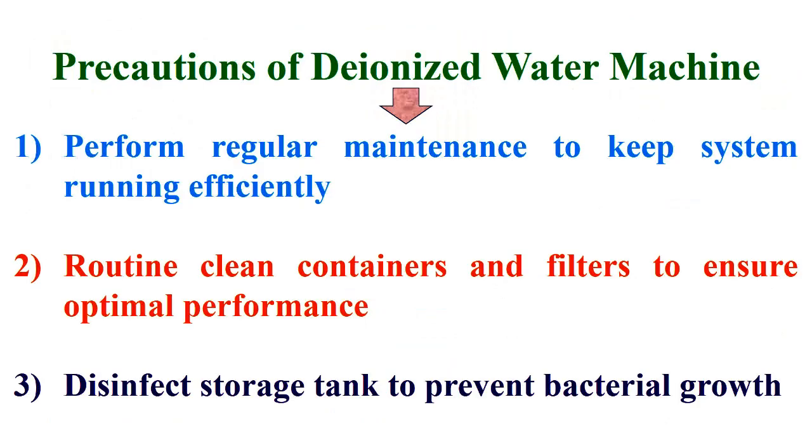Therefore, when working with a deionized water machine, you must perform regular maintenance to keep the system running efficiently, routinely clean containers and filters to ensure optimal performance, and disinfect the storage tank to prevent bacterial growth.